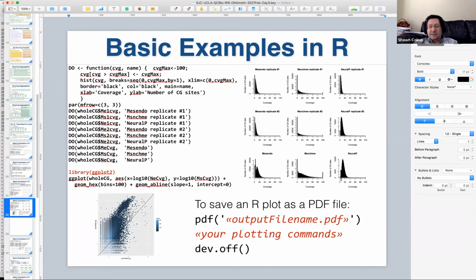The neural one looks kind of okay. The mesendoderm maybe a little worse and lower. Anyway, these peaks are not great. So maybe by the time we're pulling neural, maybe that mode, it's hard to see without making this bigger, but it looks like it might even be above 10. Of course, there's a spread, but some things are 20s. But by the time you get to 25, that's not too common. Mesendoderm's got this part that goes up to 40 and so on, but it's got a lot of zeros too. So anyway, such is our coverage.